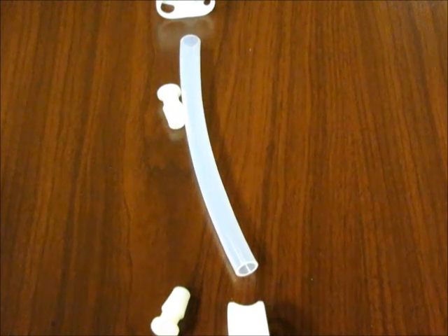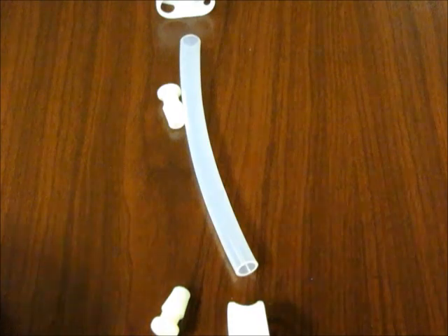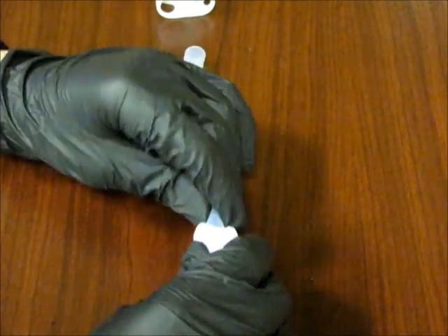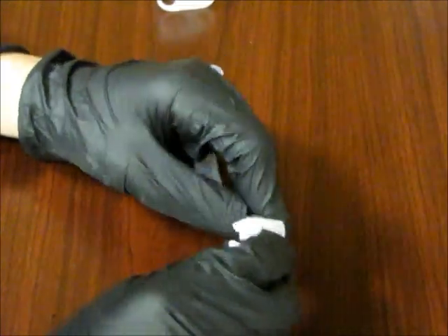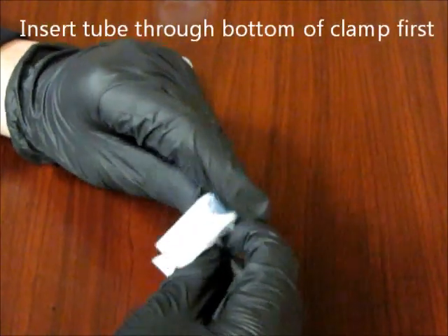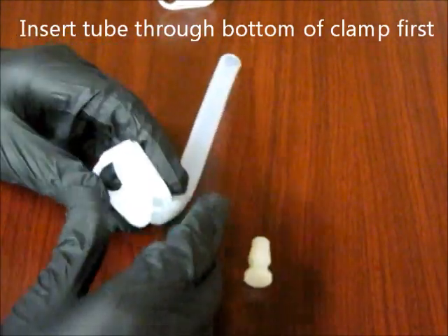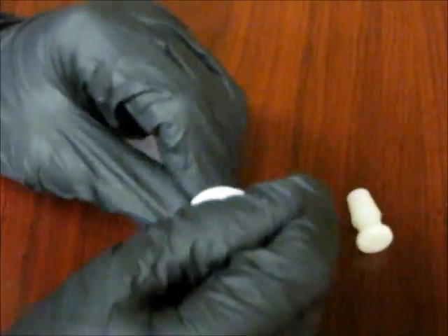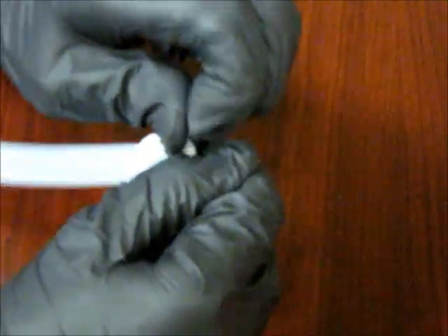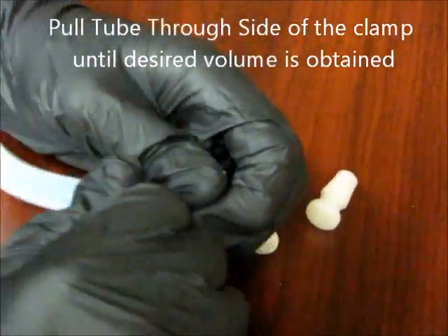The first step in the process of creating a mixture tube is inserting the clamp onto the silicone tube. We begin by inserting the tube through the bottom of the clamp first. Once the tube is through the clamp, we continue by pulling it through the side of the clamp until we get to the desired volume.